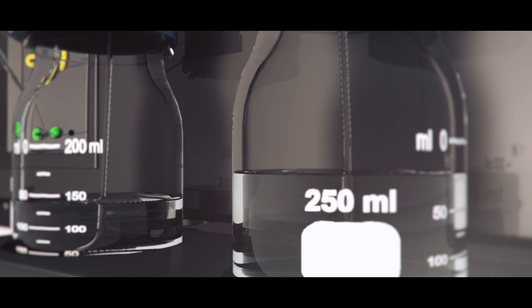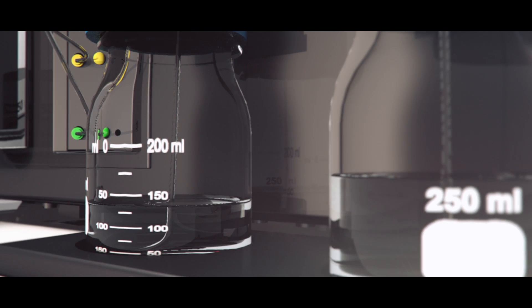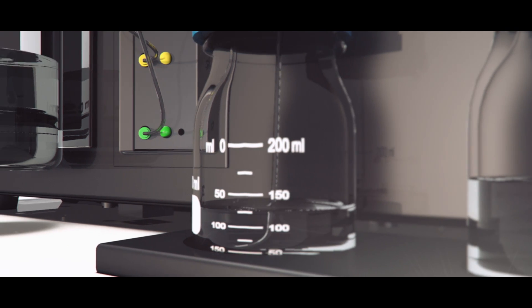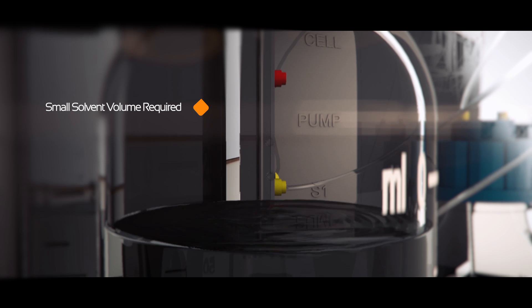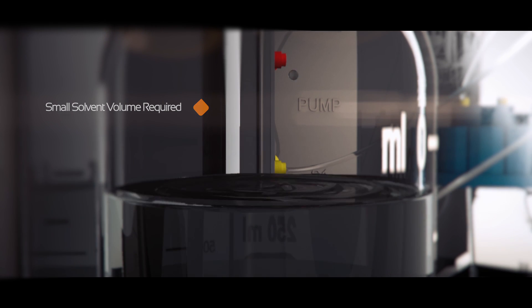Last but not least, as the cleaning solvents and waste are stored in glass bottles directly connected to the instrument, my team is less in contact with aggressive chemicals, while the solvents recycling management costs are reduced. We are no longer forced to operate the instrument under a fume hood to manage the VOC emissions.